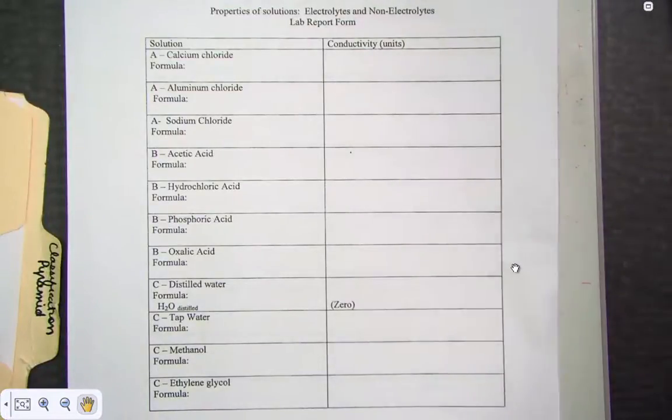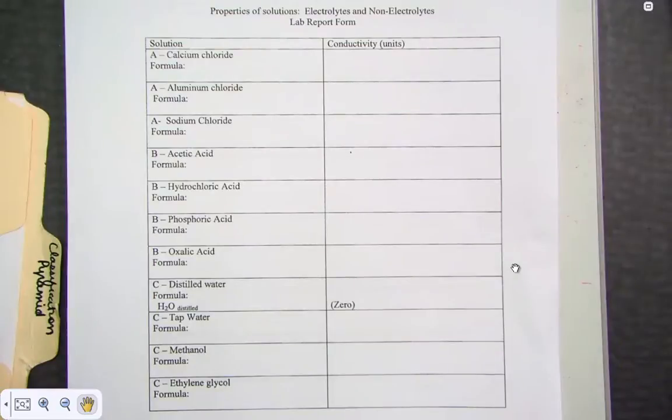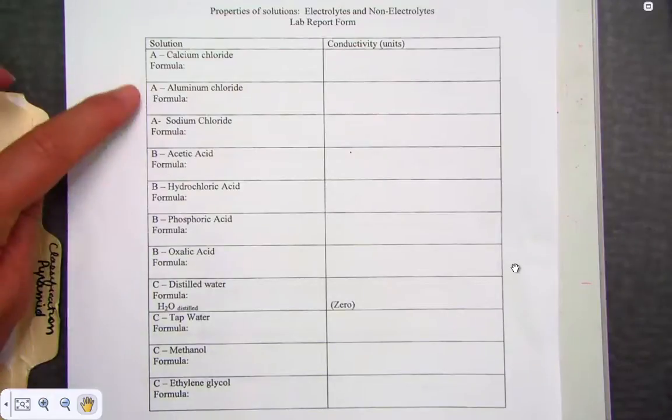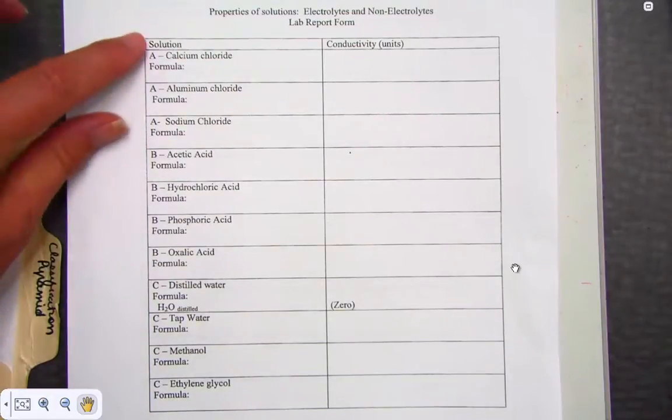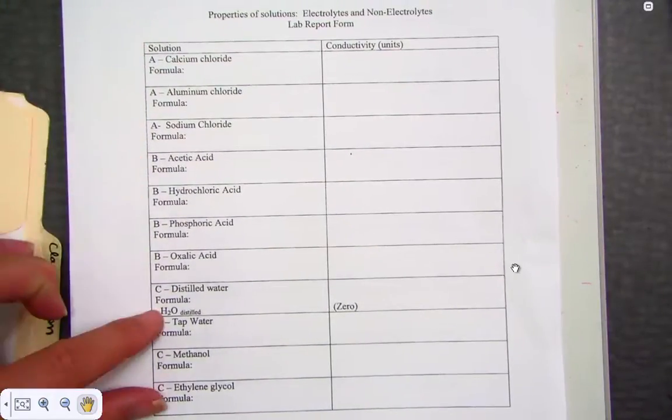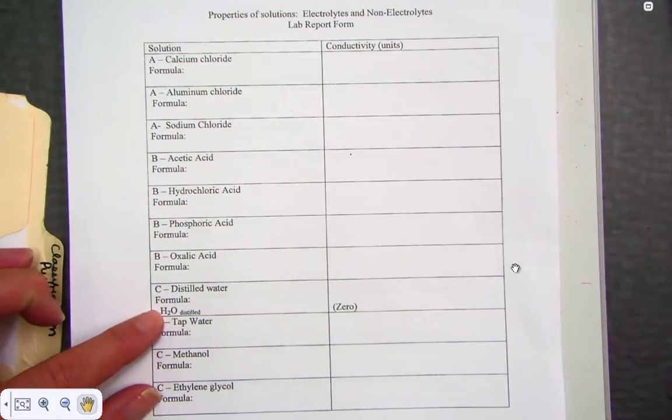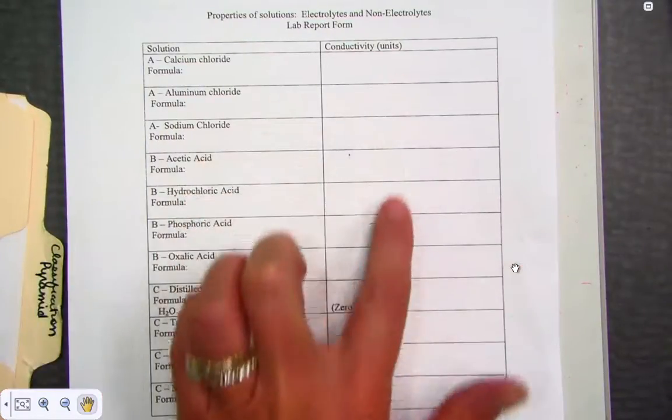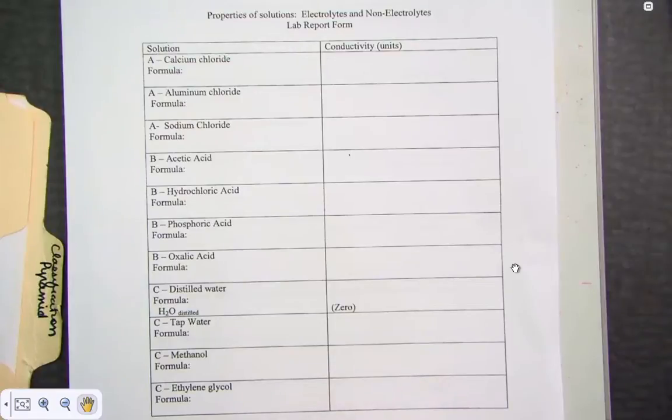This short video lesson will allow you to debrief on your electrolyte lab we conducted with the use of a conductivity meter. We had three categories of compounds, category A, B, and C, in which we placed a conductivity meter and simply had to record the value given to us from our calculator-based chemistry.